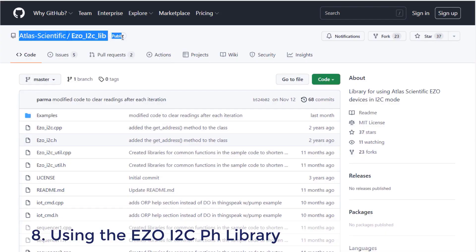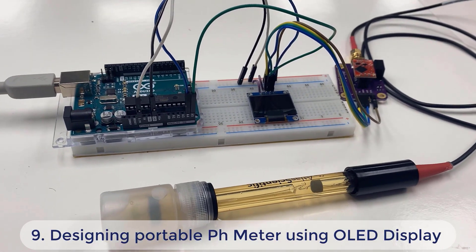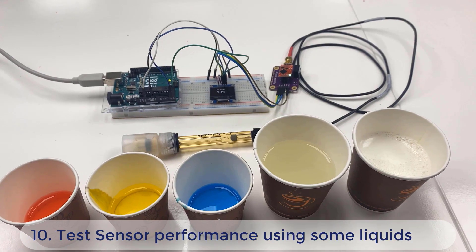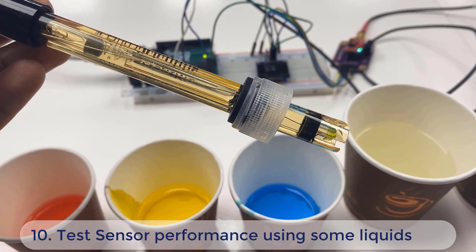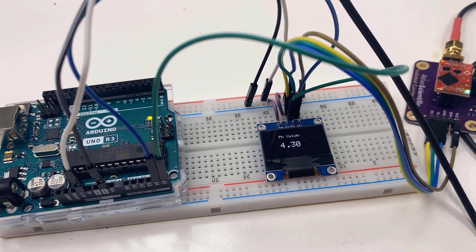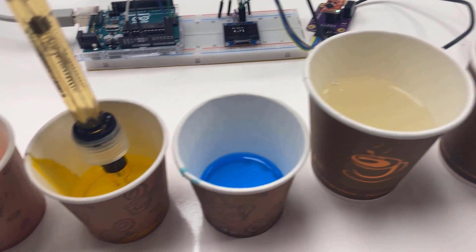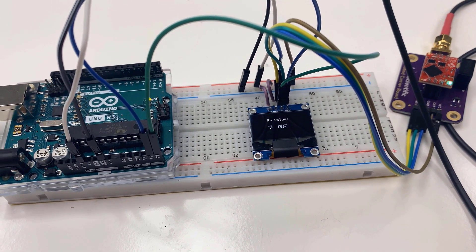We will then do the calibration of the sensor using all three pH calibration solutions, and I will show you how to use the EZO pH library. In the final section of the video, we will design a portable pH meter using an OLED display and test its performance using some liquids like water and milk. This video will be very interesting, so watch till the very end. Without further delay, let's get started.